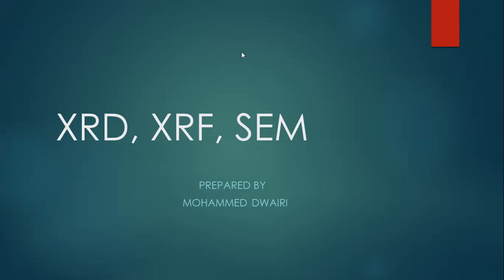Okay, this is a very good question from Karina Franco. In order to calibrate the XRD and the XRF machines, first of all, you need to know what materials you have to deal with.